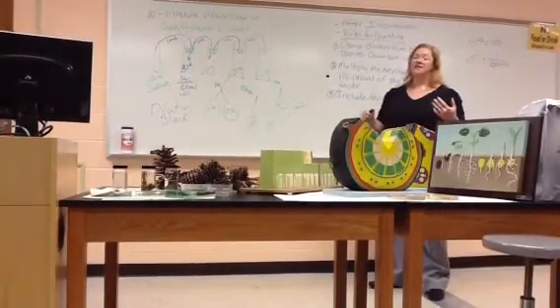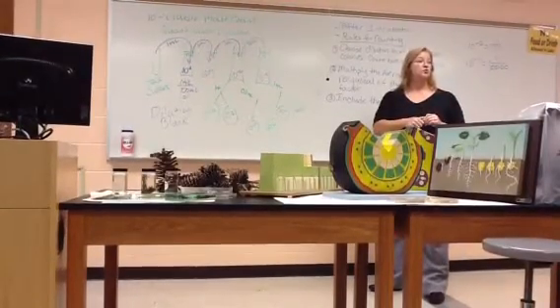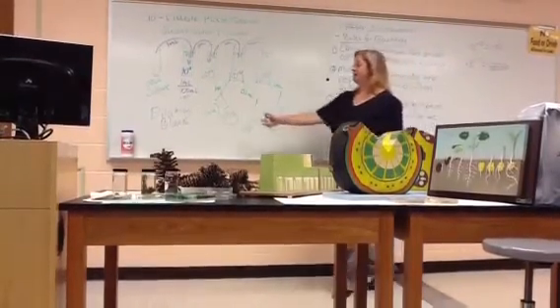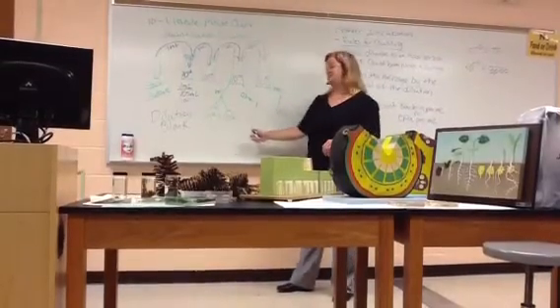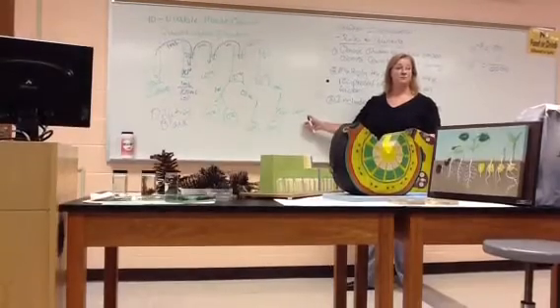Because we're guessing that when we pull them out of the incubator, they're going to look like your tube 1, tube 2, and tube 3 in front of you. That 10 to the minus 6 will look like your tube 1. 10 to the minus 7 will look like your tube 2, and 10 to the minus 8 will look like your tube 3.